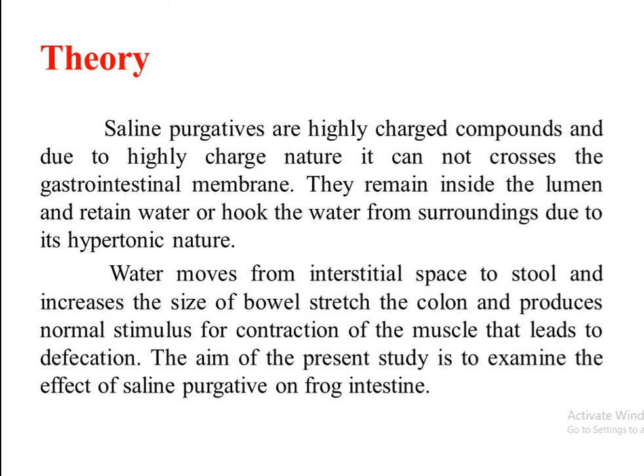As the size of the stool becomes larger, it will provide a stretch over the GIT membrane, and the stretch over the GIT membrane is responsible for giving a signal to the acetylcholine to increase the peristaltic movement, and this will ultimately result in ease of defecation. So this is the normal mechanism behind this experiment of the saline purgative.